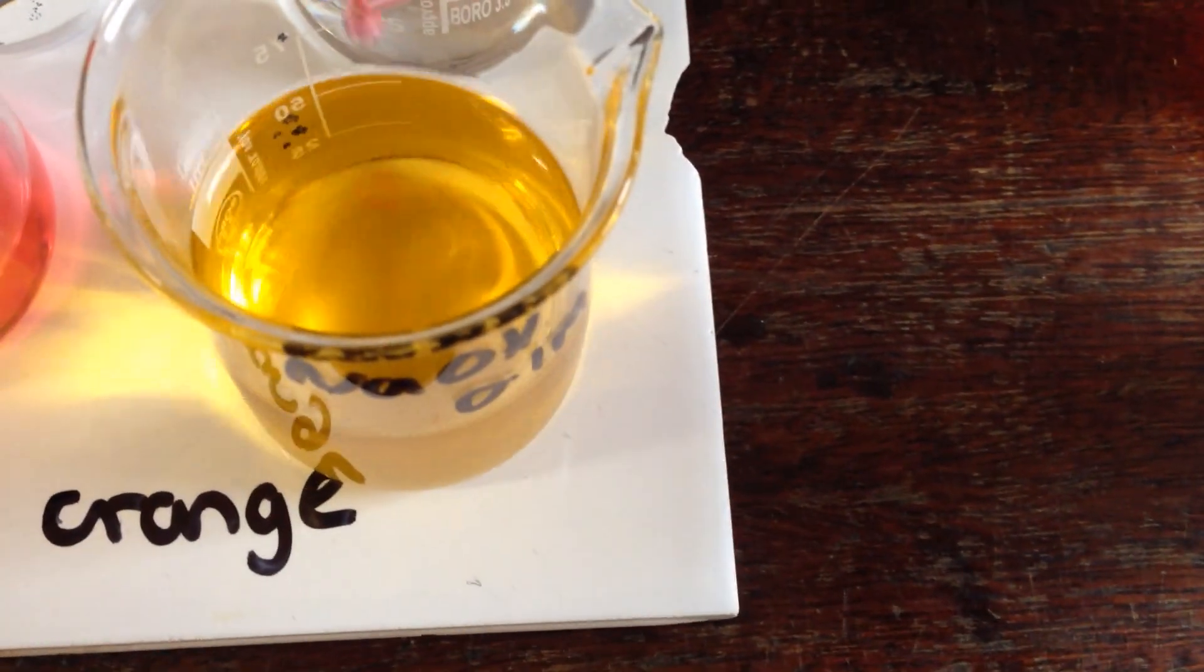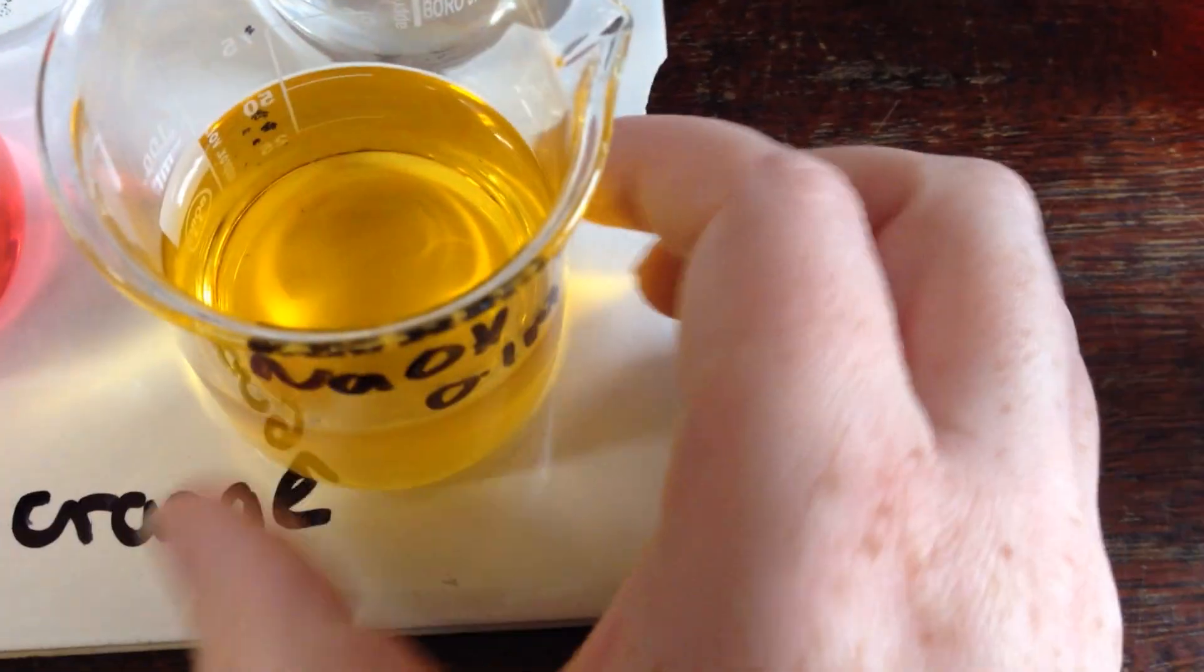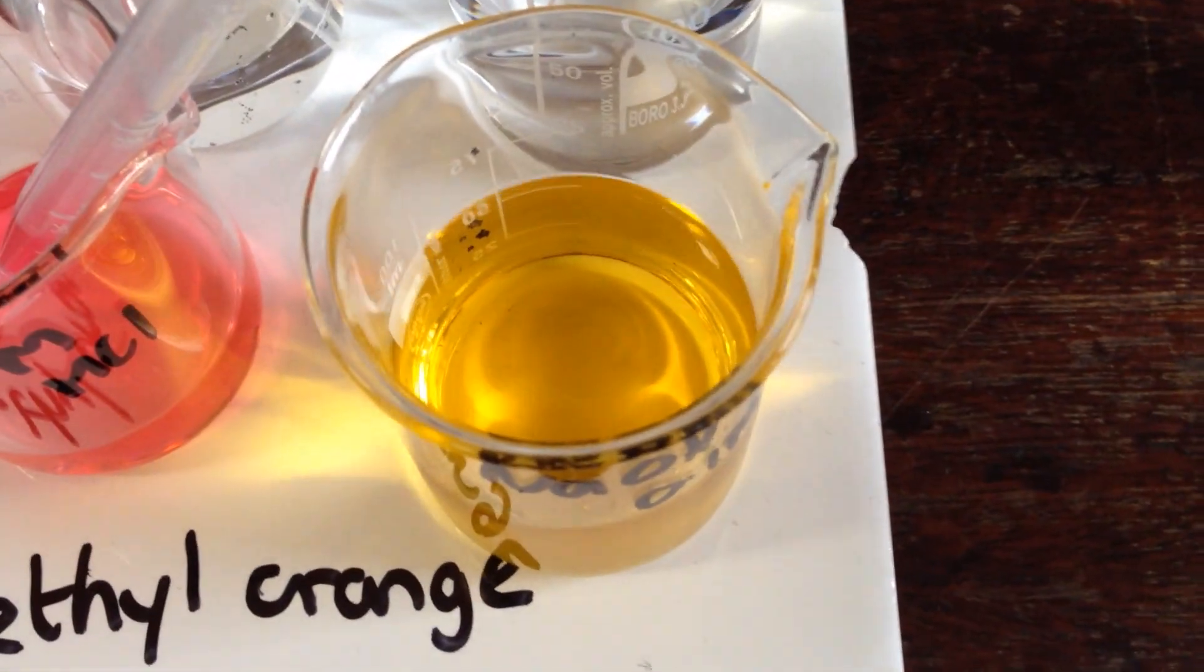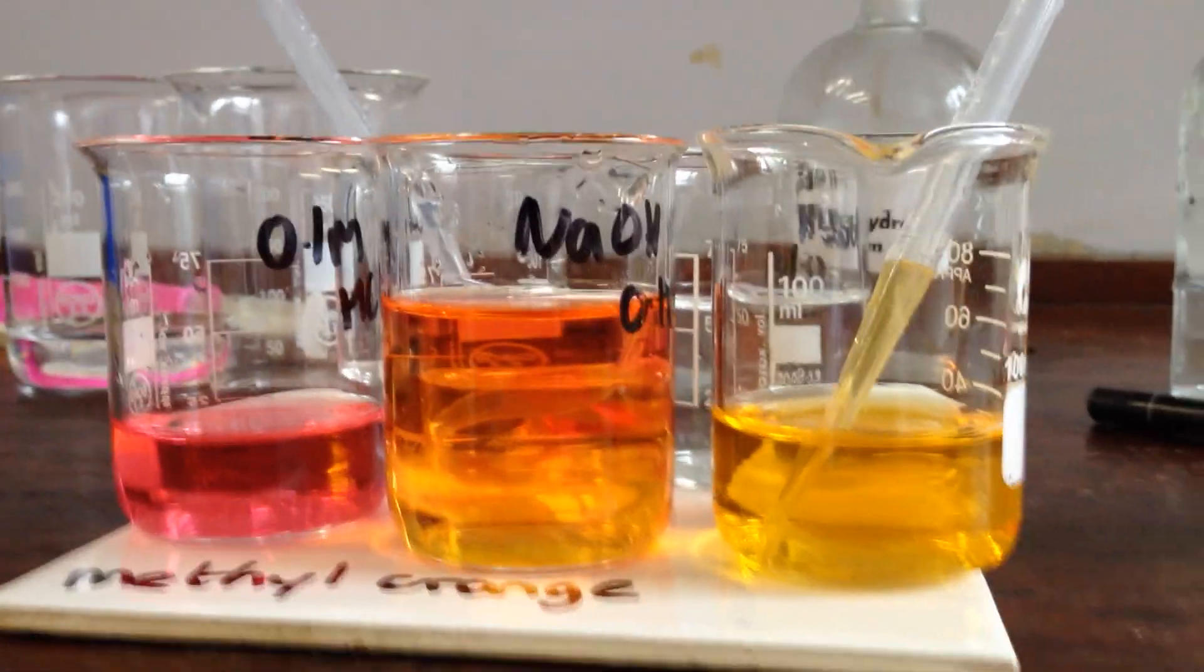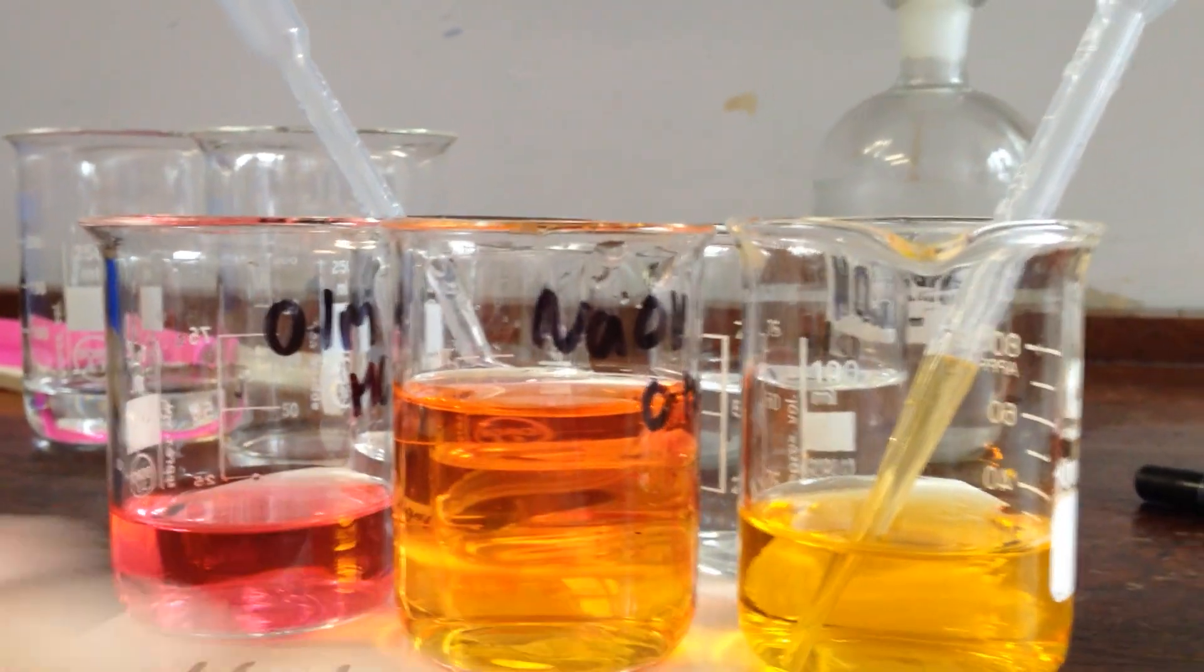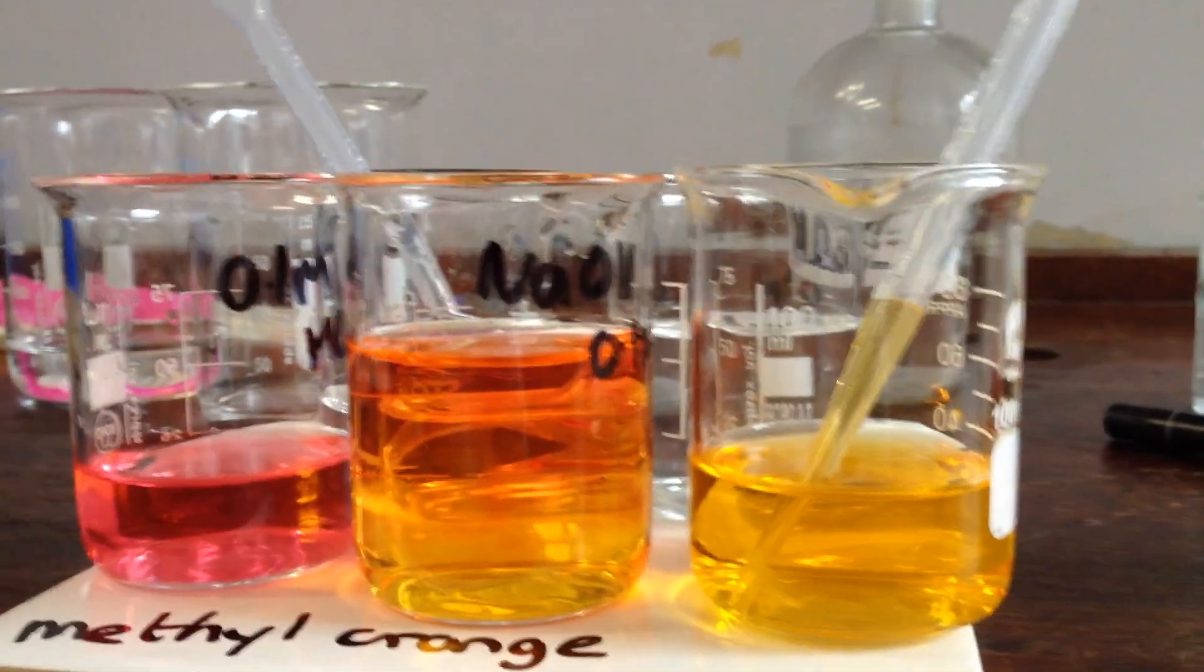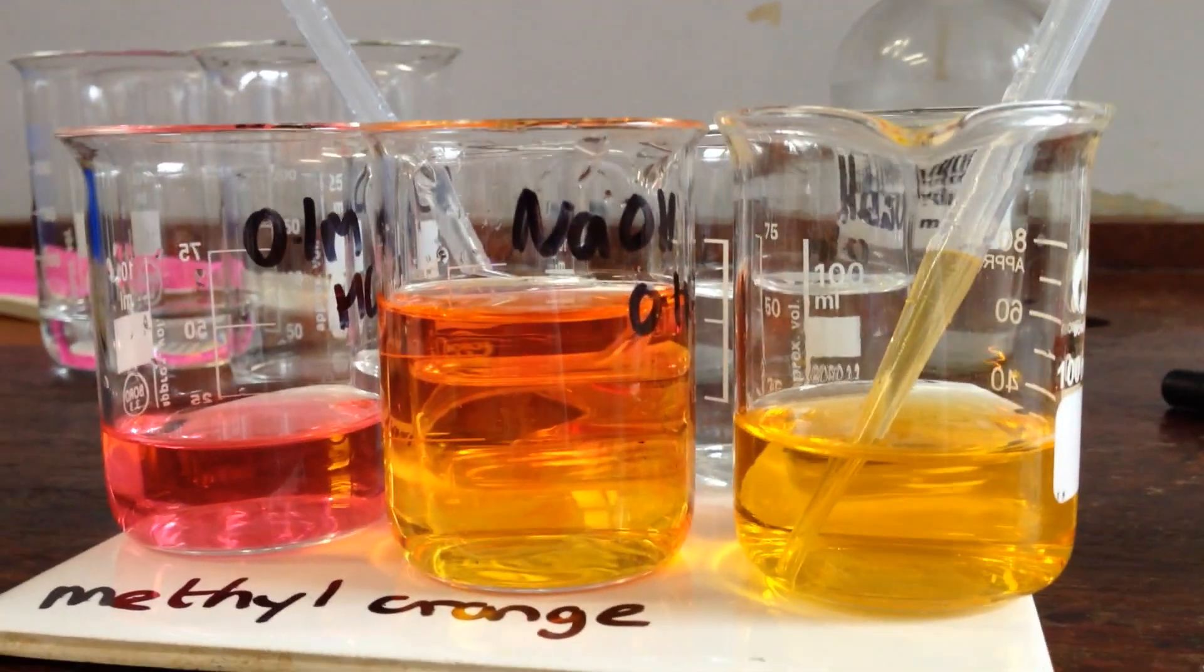When you're doing this, you can always have a reference sample by the side so you can see the color change happening. So there we have it: our alkali in yellow, our acid in red, and our orange mix of the two.